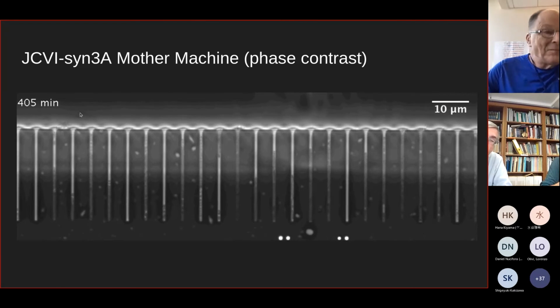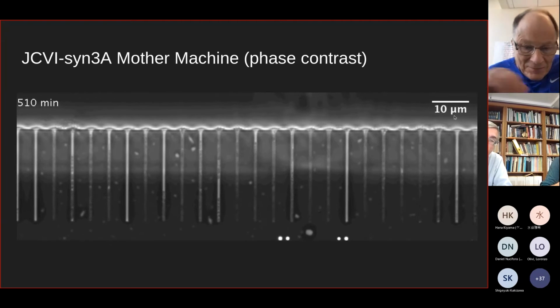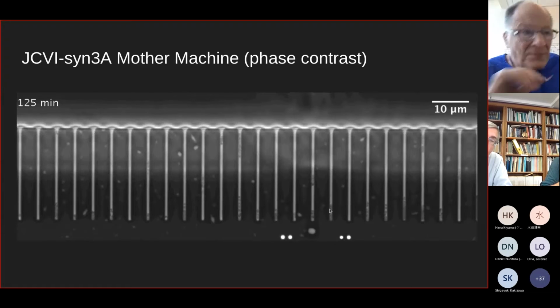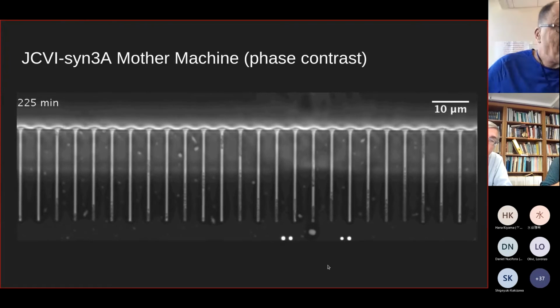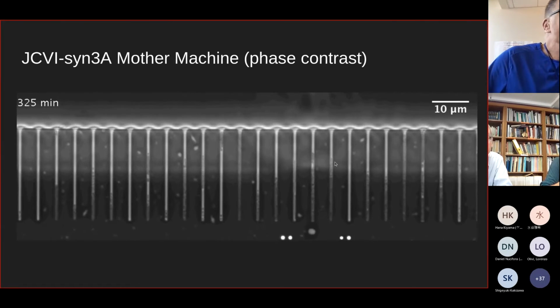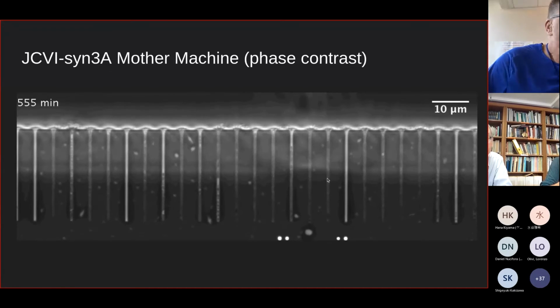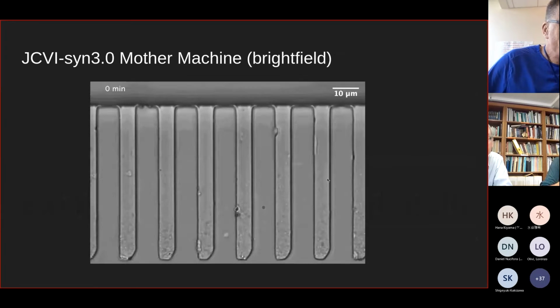Here we have the fluid flow up top. We have channels that are roughly 0.5 micrometer in width. We've loaded them with Syn 3A, as you can see, and they're growing up, and then they start pouring out of the mother machine. So this was just a preliminary show.